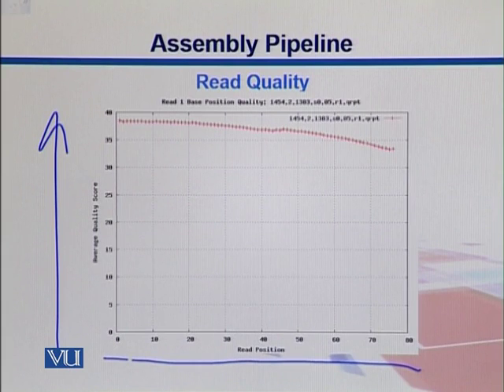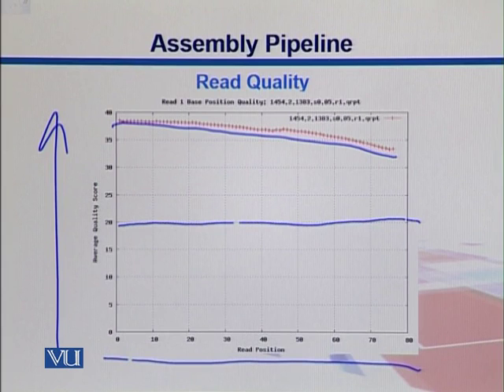Starting from the left-hand side at nucleotide number 1, we see the qualities are really good, close to 40, and then they keep decreasing. That is quite expected in Illumina, where towards the 3' end of the reads the qualities are slightly lower, but still higher than the threshold. Normally in our experiments the threshold is 20, so any score above 20 is good.